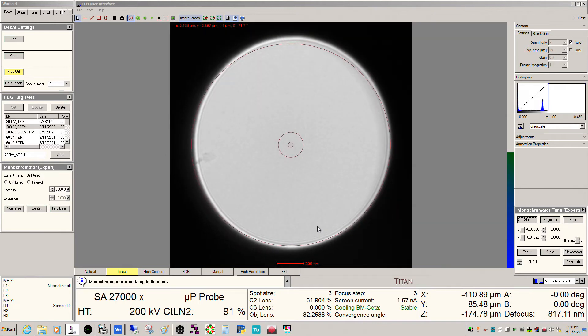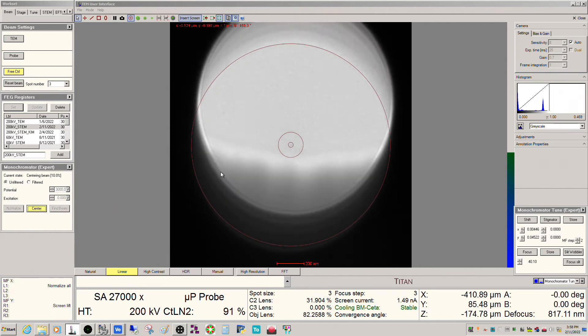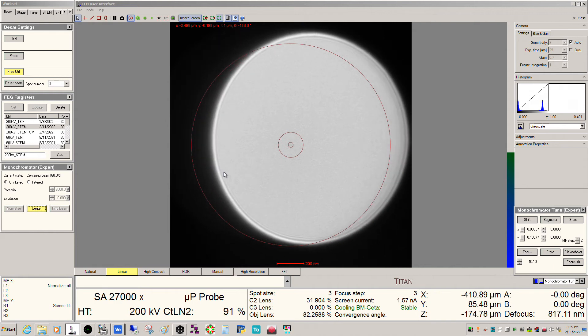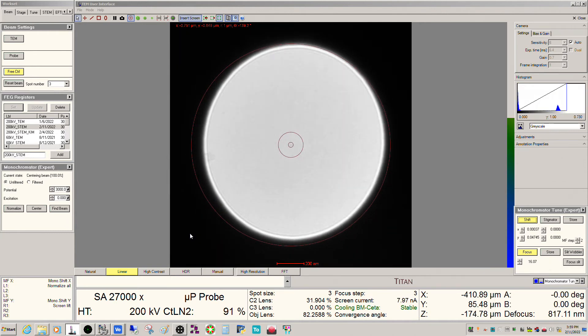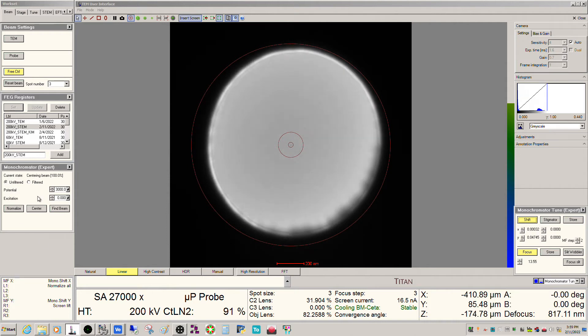This seems to have worked pretty well. Just for the sake of argument, let's go ahead and run the centering routine — that was our initial current, so we'll see what we get. All right, not too bad — basically the same number. So checking the automated against the manual, we're pretty good here. That centering routine works really well. I'm recalling basically a focus here, but then the shifts might be off, so you can use centering to properly center the monochromator.